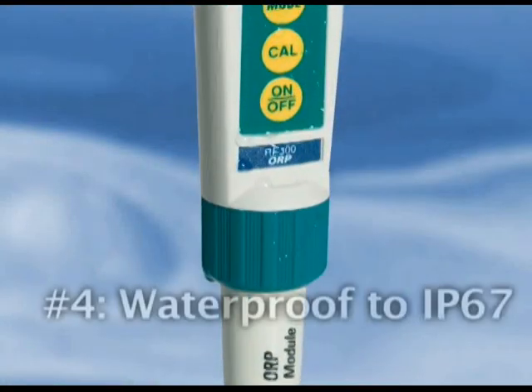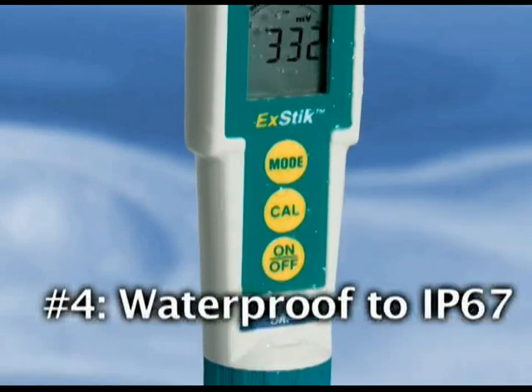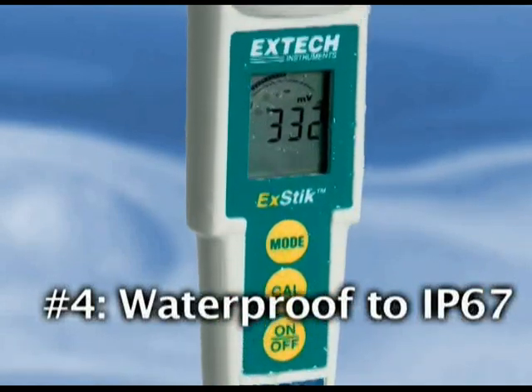4. The ExStik ORP meter is completely waterproof, meeting the standard of IP67. This assures safe and accurate measurements even during extreme wet conditions. The meter also floats when dropped in water.